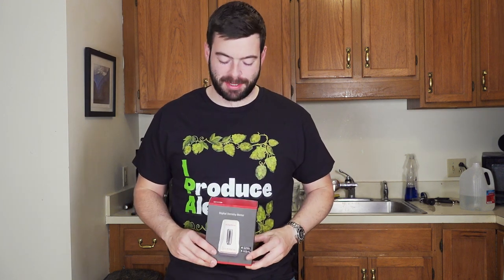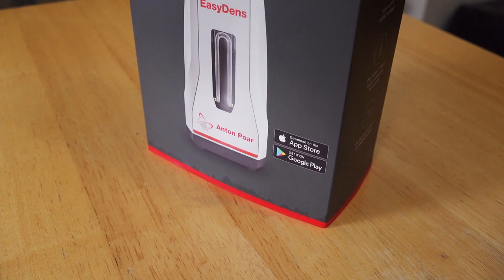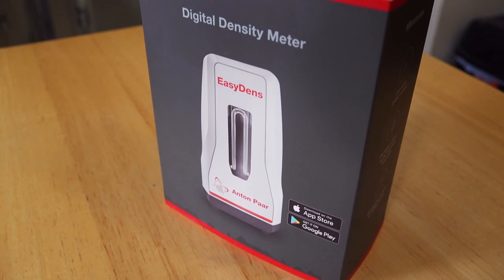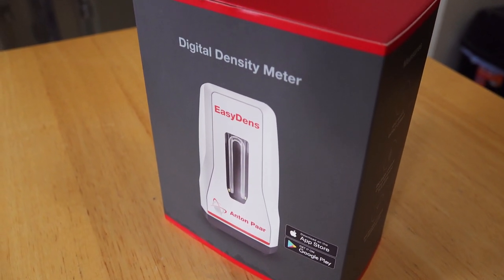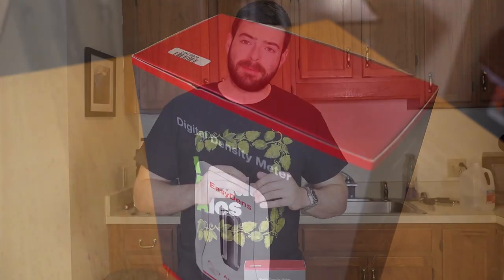In one sentence, this is a rocket science level hydrometer. This thing is seriously impressive. Is this something that you need to produce quality beer? Absolutely not. This is 100% a want and not a need for 99.9% of people out there, unless you're a lab-grade brewer. That being said, it is an extremely interesting product, and I think it has a lot to offer.